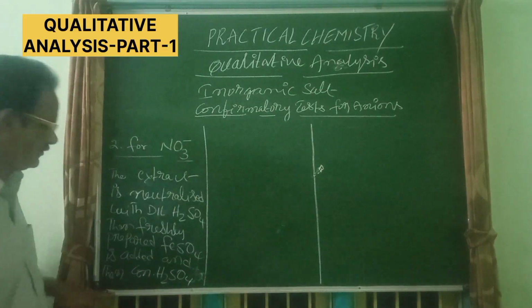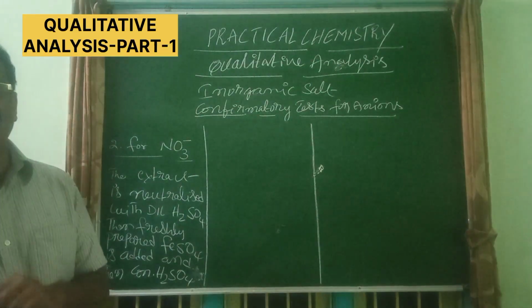Concentrated H2SO4 is added. Is it clear?